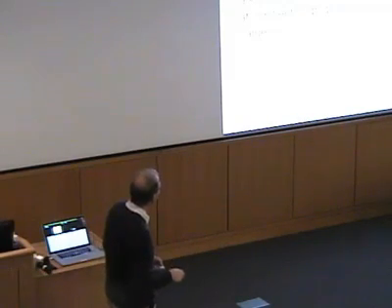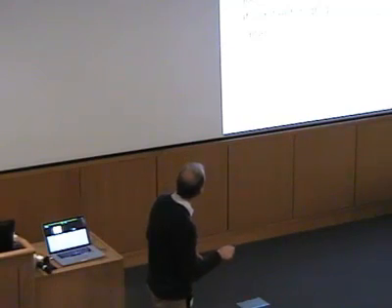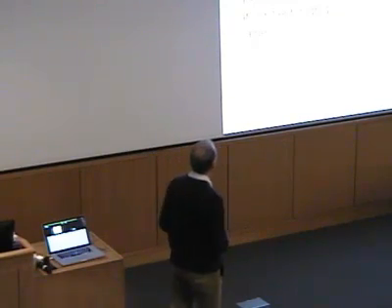And here this would be, actually I've forgotten what the actual G value is here, but anyway, something like 4, which is very far away from the free electron value, which would be 2.